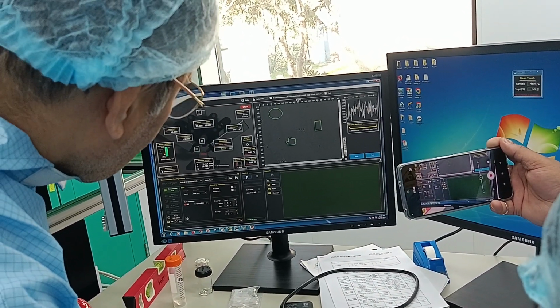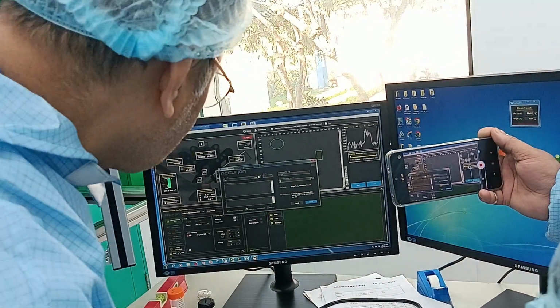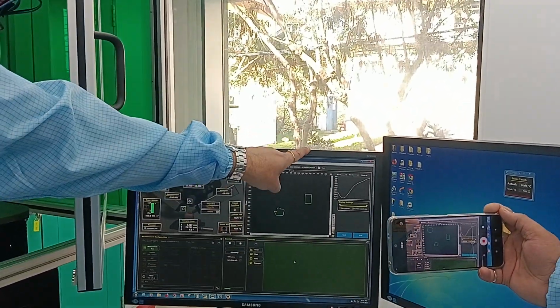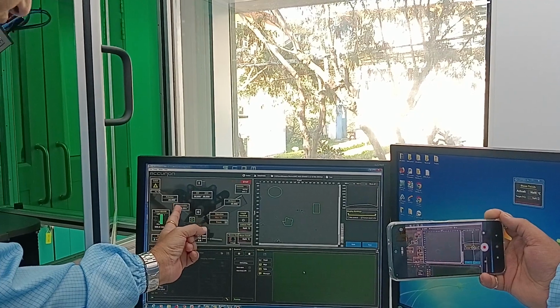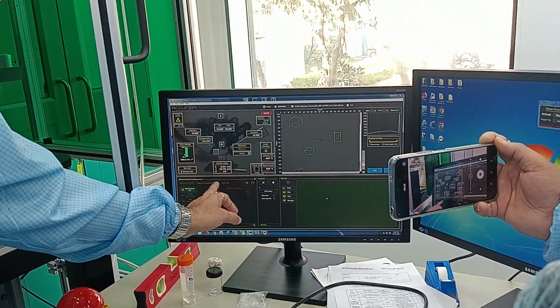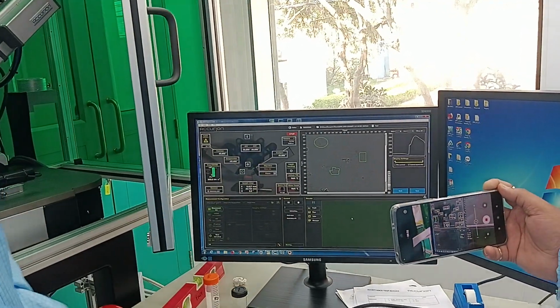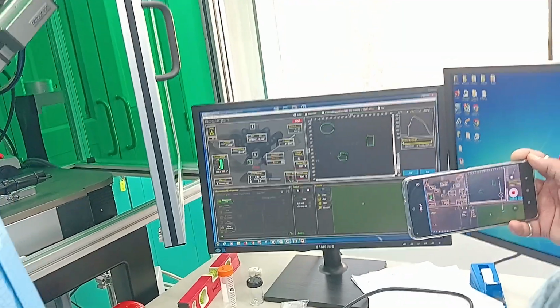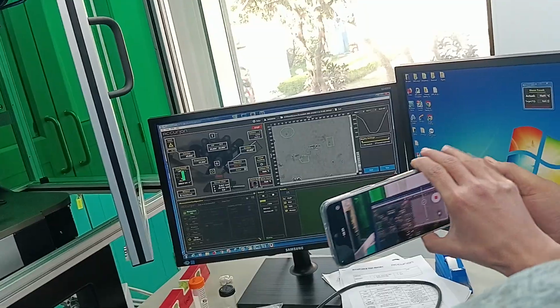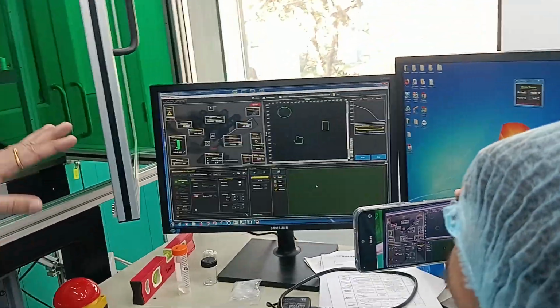So when I say start, it will now start measuring. It will ask me what name I have to give. So I do that, okay, and again it goes up. So you can see here what's happening is the polarizer and analyzer are kept constant. This is the RCE mode, which is a fast measurement mode. It will be changing the compensator and evaluating the null point and gives you delta psi automatically. But I'm not doing nulling, I'm just doing an RCE. So my data is there.